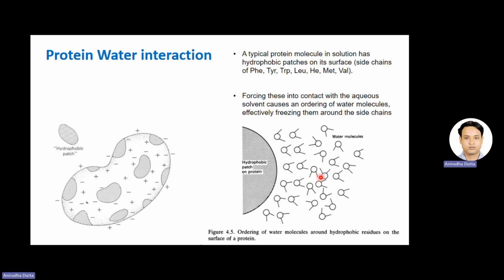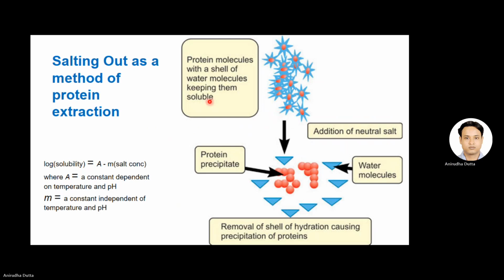So if you add a salt that can pull out all these water molecules around the hydrophobic patch, it will enhance the ability of two protein molecules to interact through intermolecular hydrophobic interaction, and then it will promote aggregation. That phenomenon is called salting out.